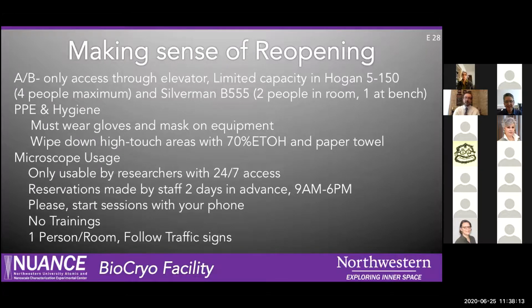Please make sure you're wearing a mask and gloves at all times on the instruments. I know it's not fun, but we really want to make sure that if we have just one case, we're done. We have to shut down. So please wear your gloves and your masks while using the instruments at all times. And when you're done, and if you're not feeling comfortable, you can do it at the beginning too, please do wipe down all areas.